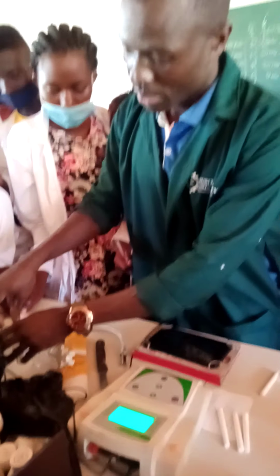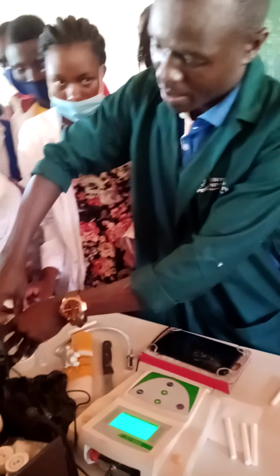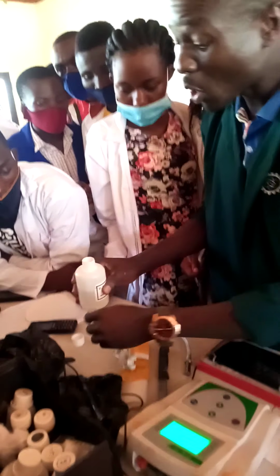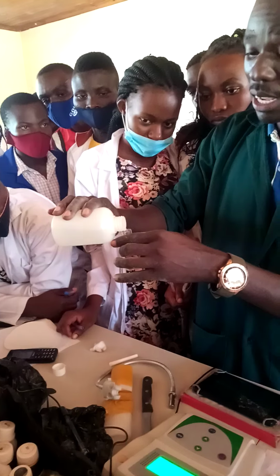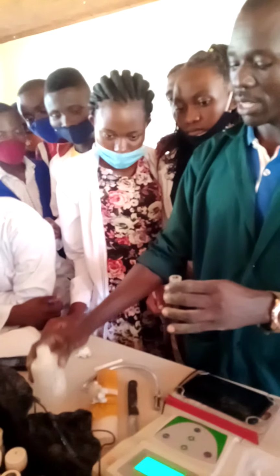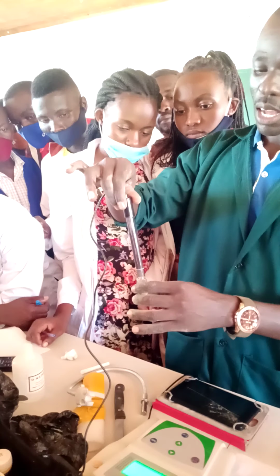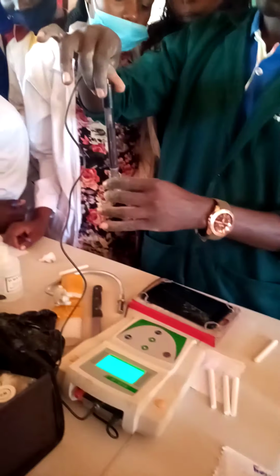Now this sensor has to be in distilled water, not mineral water. Mineral water is not distilled water. It's distilled but not deionized. It has to be in deionized water. So you can read from the screen what is happening.